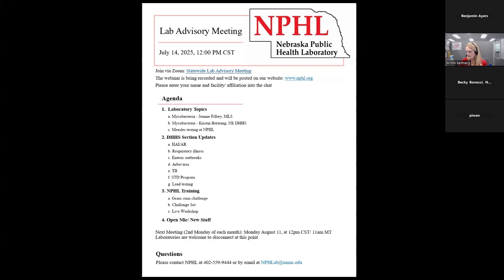Whole genome sequencing, Jean mentioned this briefly. We are doing that with all of our drug susceptibility testing, as there's been problems with some of the test kits with pyrazinamide.